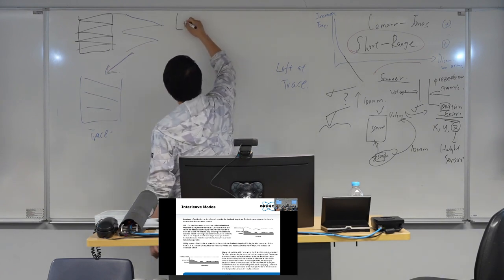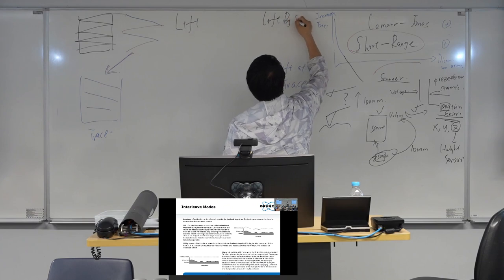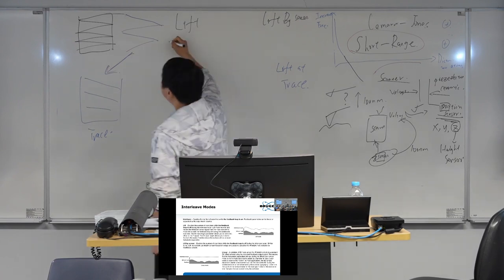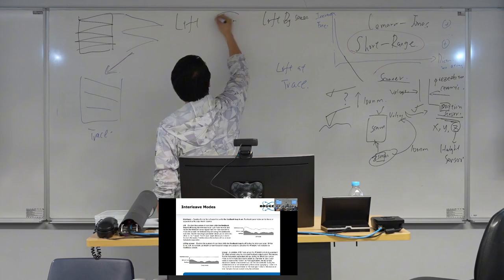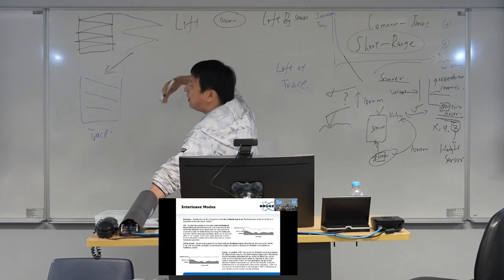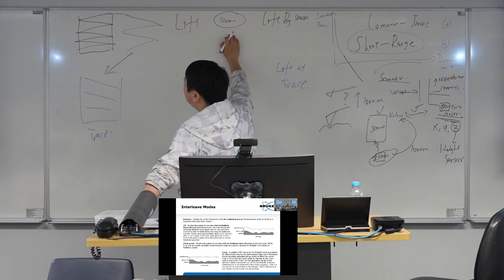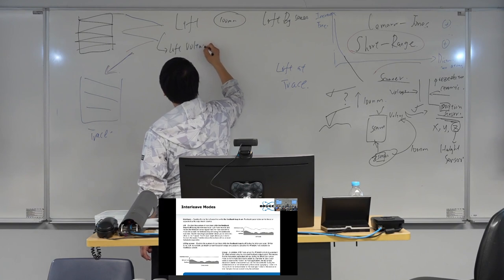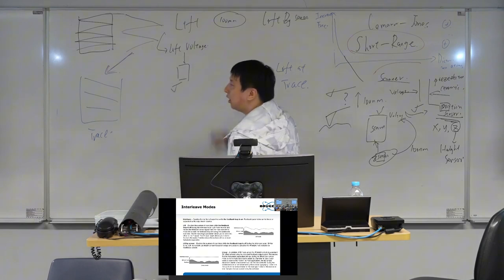There's a lift. There's a lift by sensor. So for the lift, from the software, we always use the 100 nanometer as an example, okay? So from the software, you apply a 100 nanometer lift distance. And then from this 100 nanometer, the software will calculate the lift voltage, and it applies on the scanner.